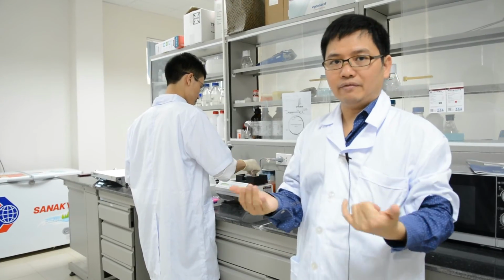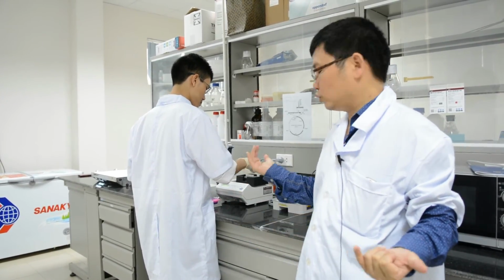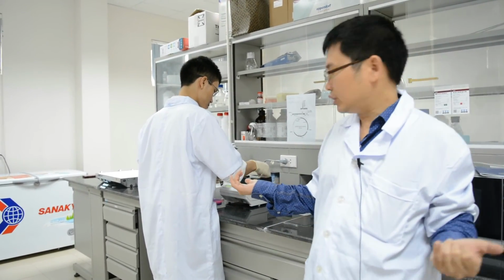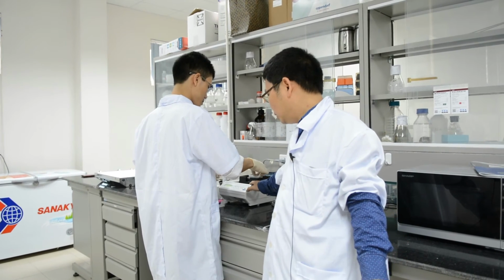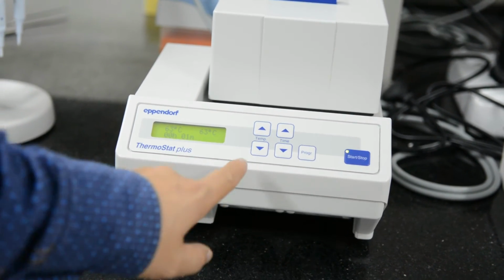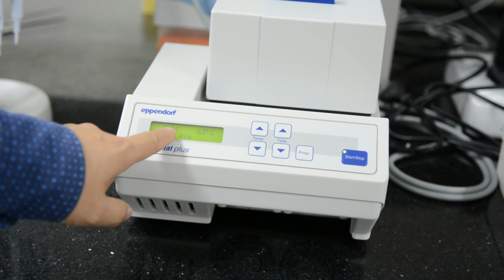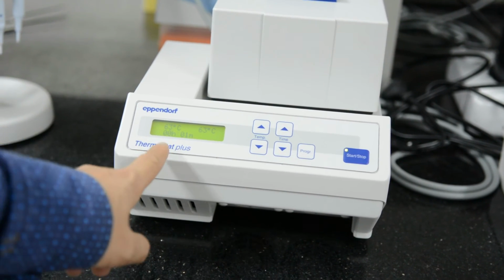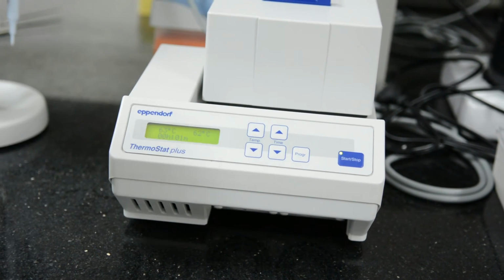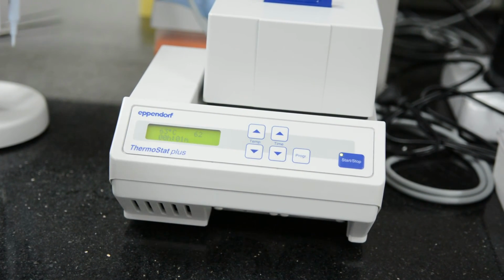After we set up the reaction, the next step is to incubate it at a constant temperature, and we don't really need a PCR machine. We use a very simple heat block incubator. What you need is to set the equipment to 63 degrees Celsius and keep it for 60 minutes. There's the counting, and when it reaches 60 minutes, we are ready to see the result.